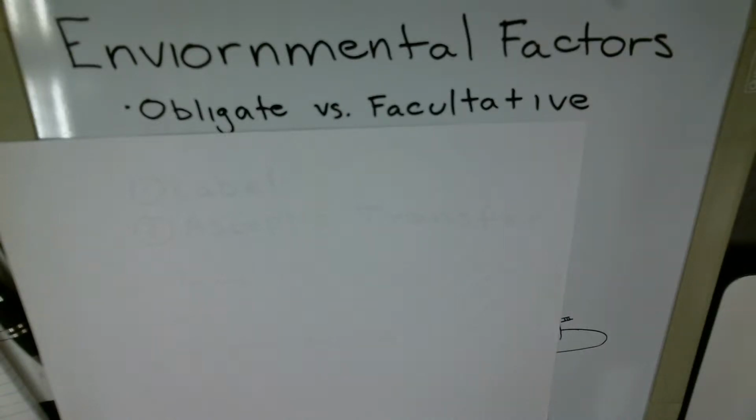Hey guys, so we're going to go over an environmental factors lab. Firstly, let's discuss obligate versus facultative. With obligate, it means that the bacteria can only operate under those conditions. So with aerobes, they can only operate in the presence of air.